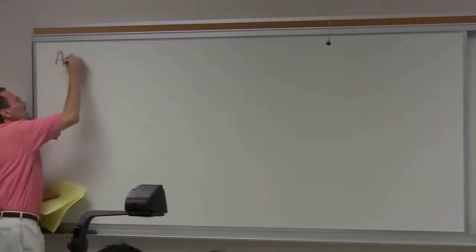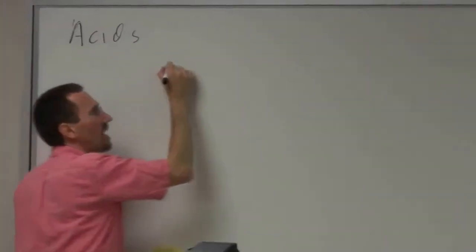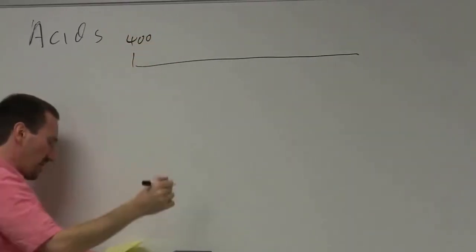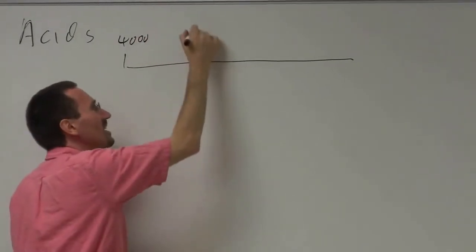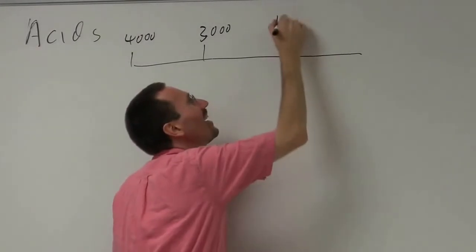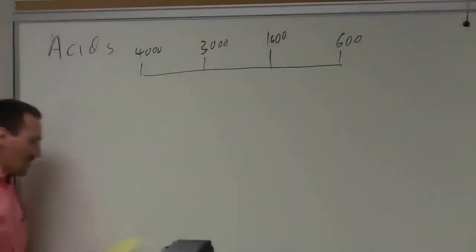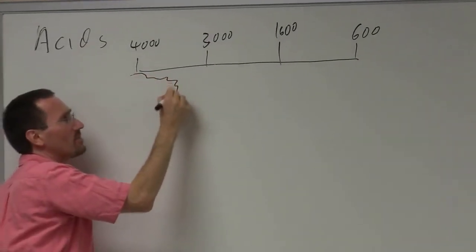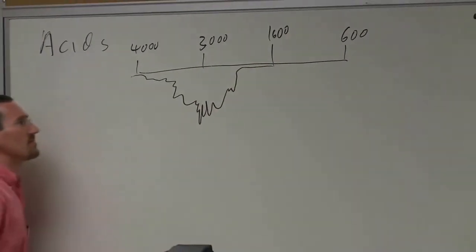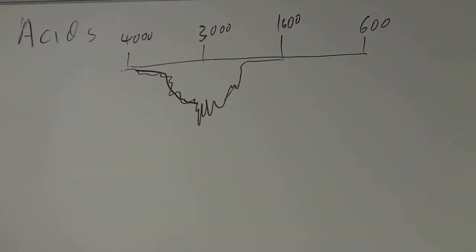So, as I said, carboxylic acids are one of the ugliest things that you're going to see in the IR, and their ugliness really makes them stand out. It's kind of like a pug dog. You look at a pug and you say, oh, that's so ugly, it's almost cute, as a matter of fact. So you look at a carboxylic acid and you just sort of have this misformed, misshapen band, maybe with some lumps and some CHs. Maybe I've over-exaggerated a little bit, but suffice it to say it's a little bit lumpy.